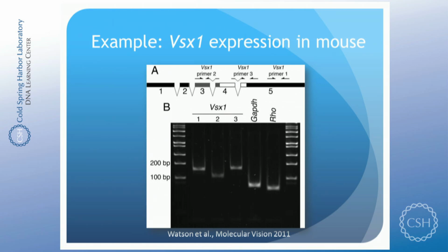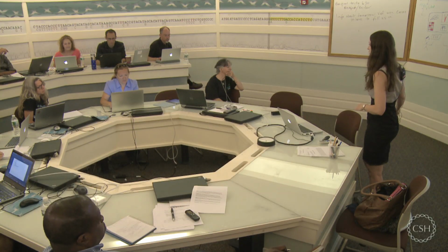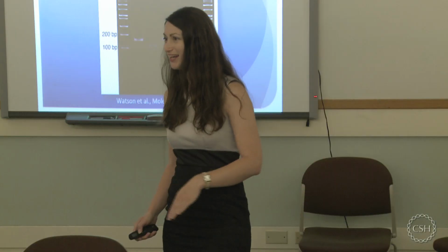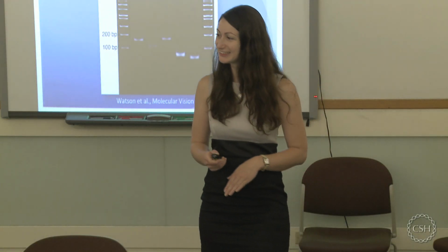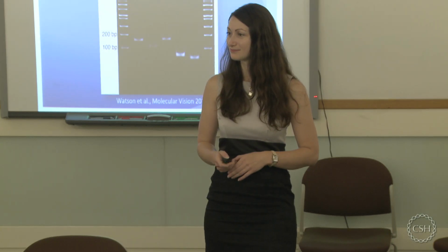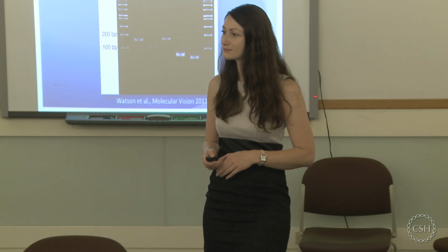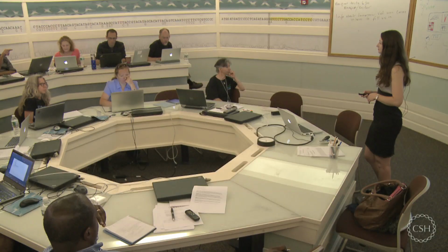So I would be a bit concerned because the primer pair 2, this one? I presume these are amplified to saturation, and yet that band is... Yeah, actually you can't see it very well on the screen. It looks a lot better on my computer. So I think it's just a matter of display. This is a little weaker, but it's pretty similar, same range as the other two on my computer. I can show you later if you like. I was just thinking about yield and the efficiency of amplification. So I don't know how that plays into the CT values that you determine. Probably not. I mean, if it's less efficiently amplified.